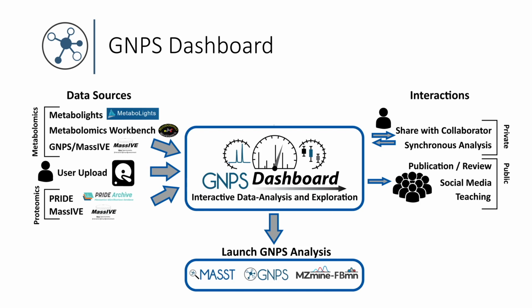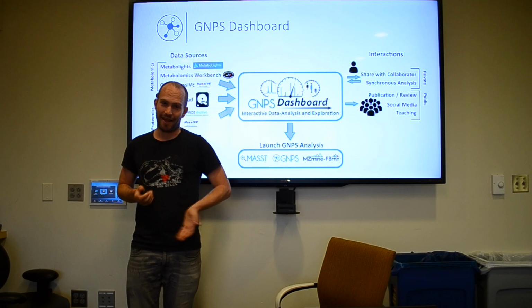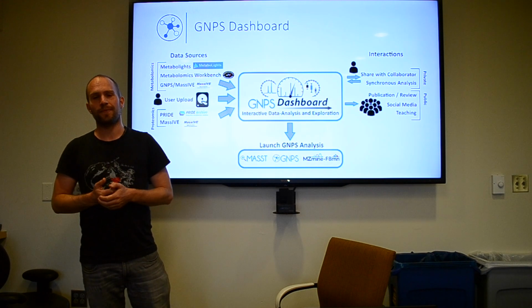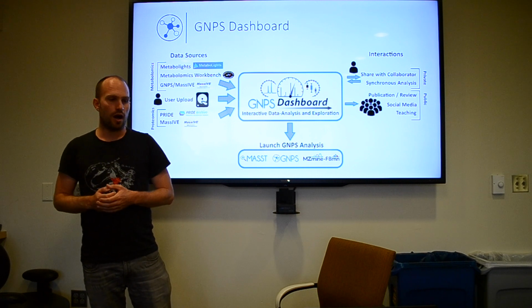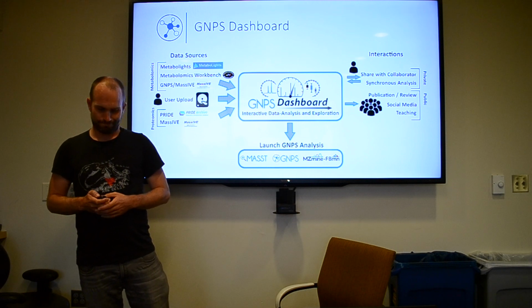And I'm very happy to do this presentation together with Ming today, and in the next couple of minutes, he's going to walk you through the details of the dashboard, and a couple of applications, and how we think this might help you in doing your metabolomics data analysis, and particularly inspection.